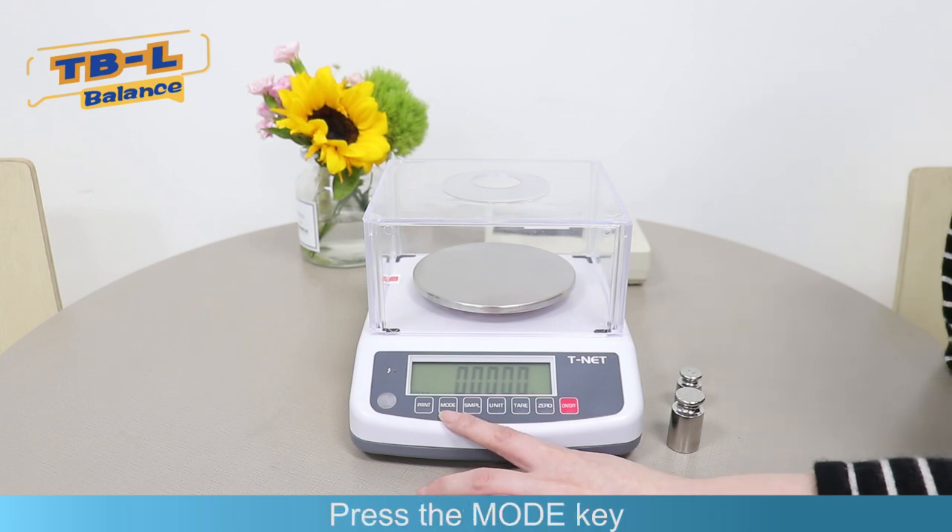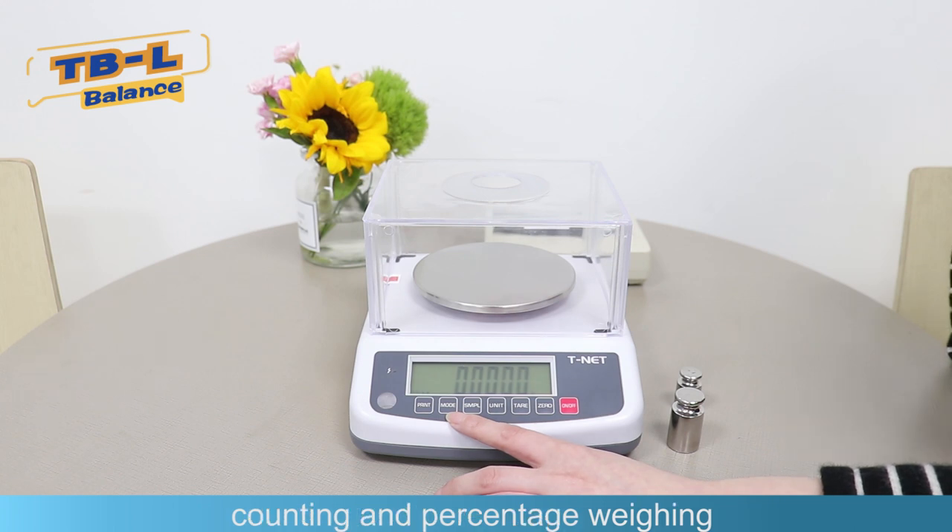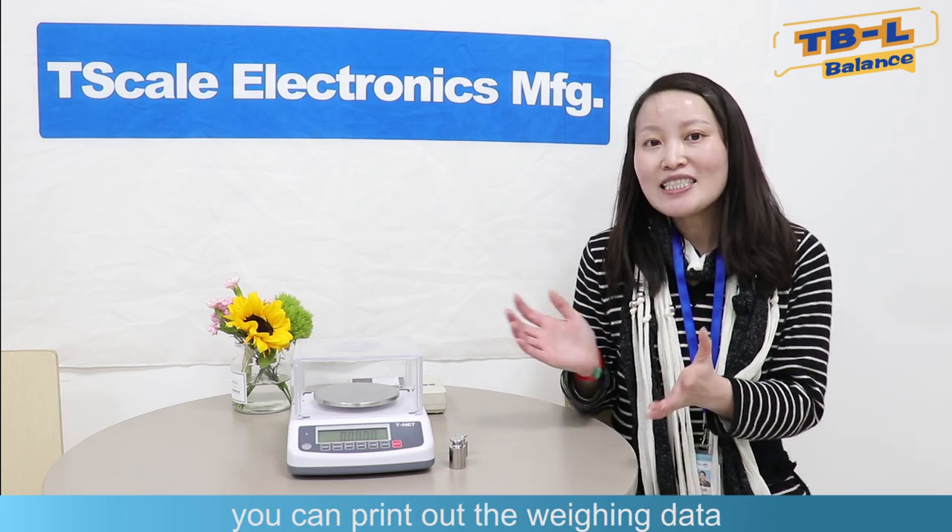There is also a mode key. Press the mode key and you can switch between normal weighing, counting, and percentage weighing. There is also a printer key — when you connect with a printer, you can print out the weighing data.